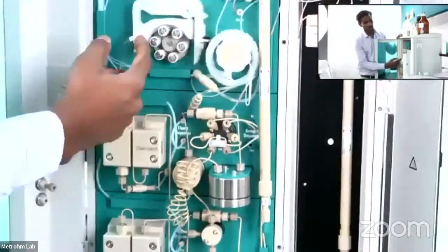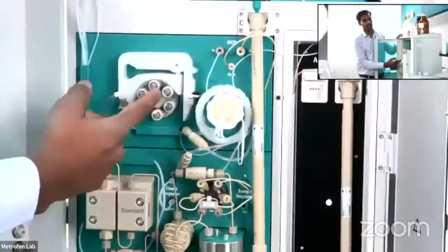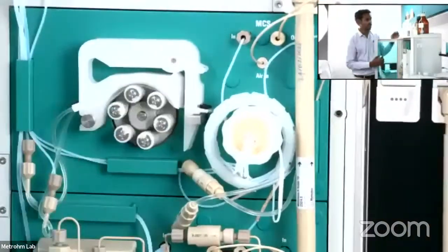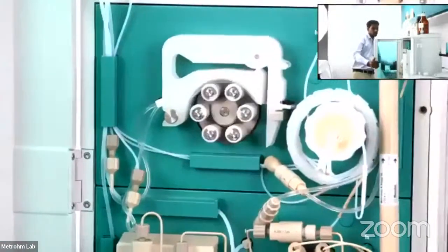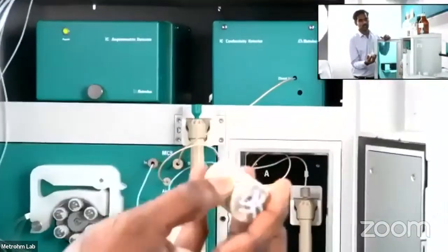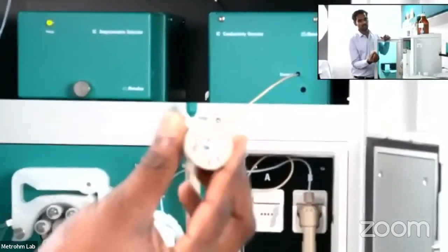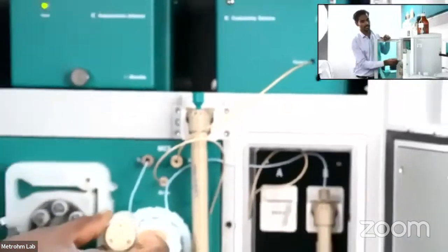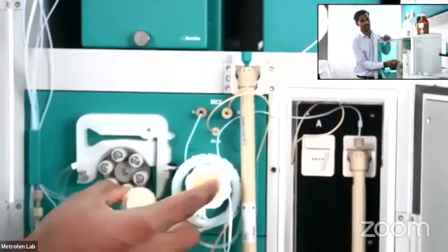And this part is called the peristaltic pump. It is used for regeneration and rinsing of our suppressor. I will show you what our suppressor looks like. Okay, so this is the suppressor part. This suppressor is called a packed bed suppressor. It is kept inside the pod.